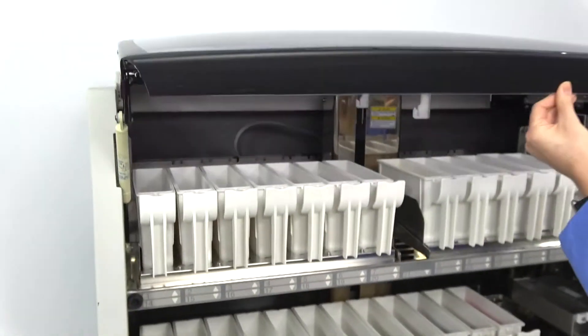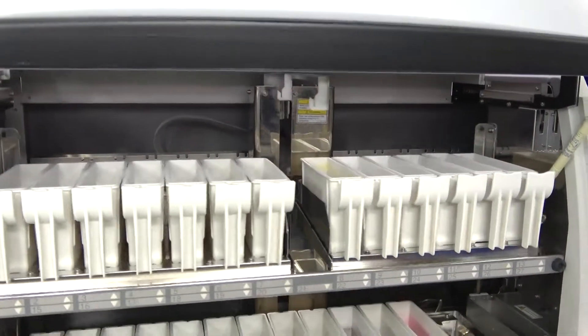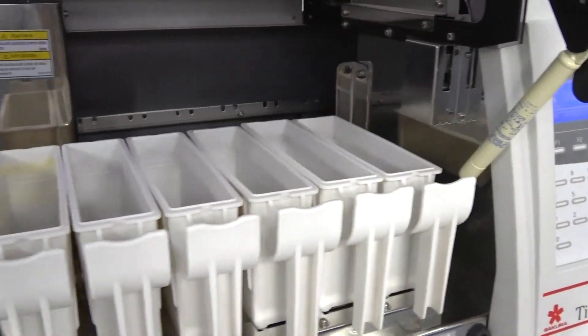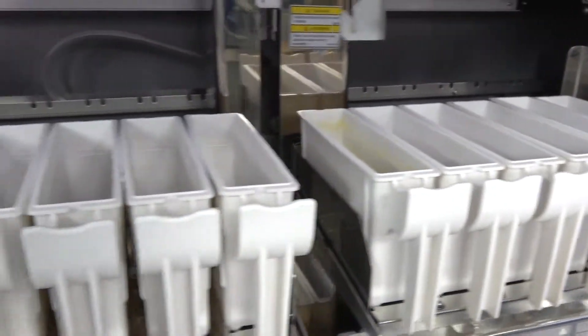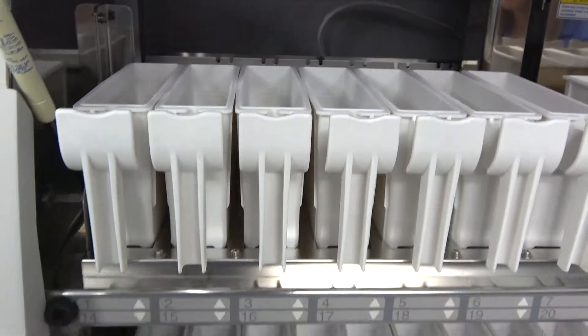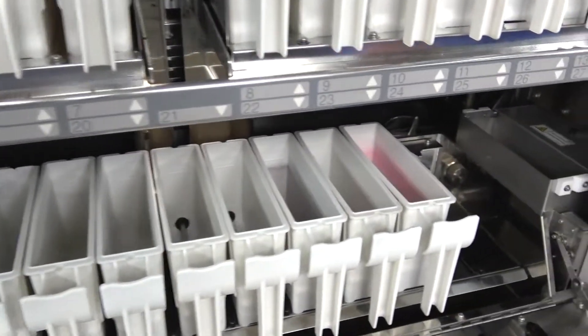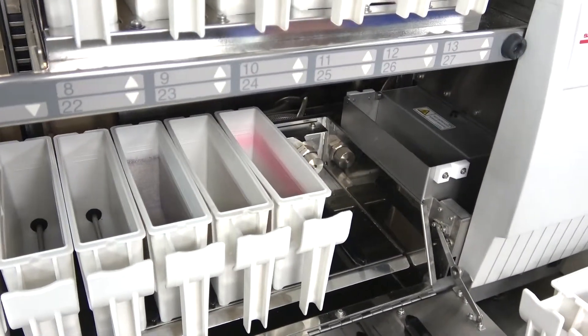And then you can notice here on the inside that all of the buckets are in really good condition. The station labels are also in really good condition and all the numbers can be read very legibly. There are a few buckets with just some minor staining.